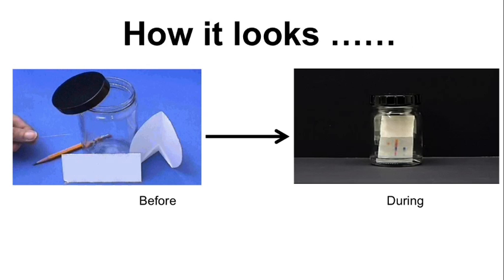Okay, so what is this going to end up looking like? Well, your TLC plate is this white thing in front, this little white rectangle here, okay, which is actually on its side right now. So the white portion of that is where your silica is, and then depending on how much money we actually have, the back of it, or the solid surface that holds our silica, could be anything from glass, the ideal situation, to aluminum, which is the cheap situation. We have the cheap situation. So make sure when you're running your TLC plate that you're putting your compound on the silica side, which means the white side. Don't try and put your compound on the aluminum side because there's nothing to separate there.